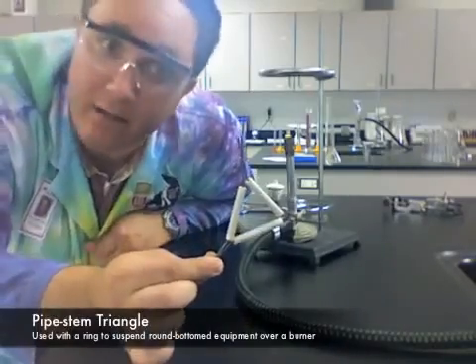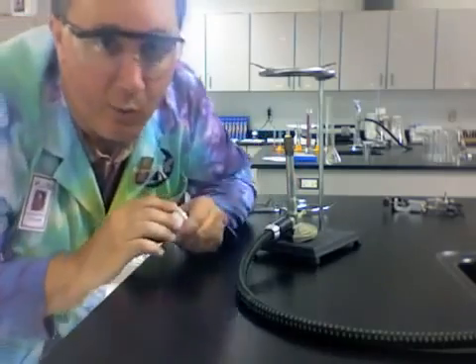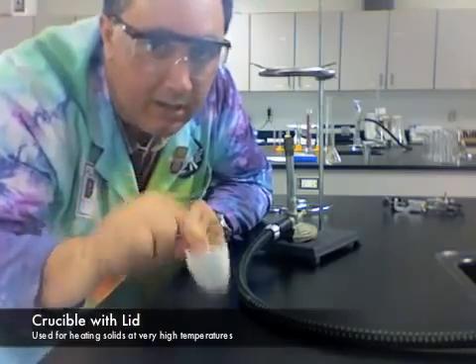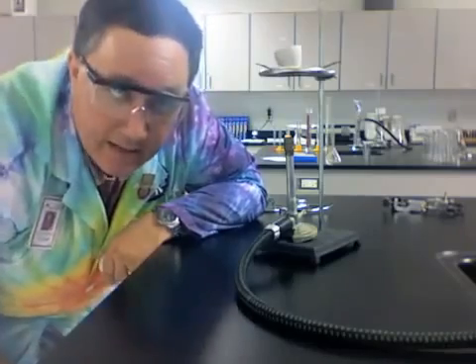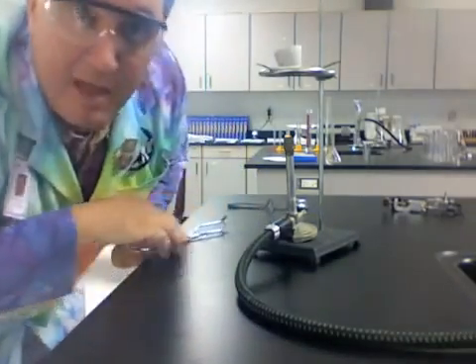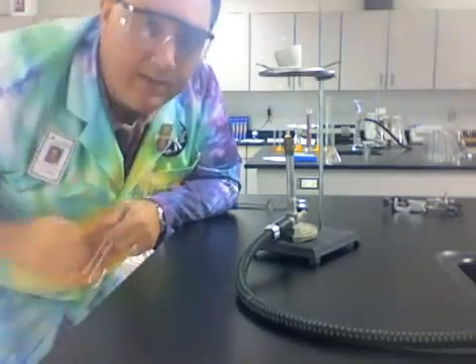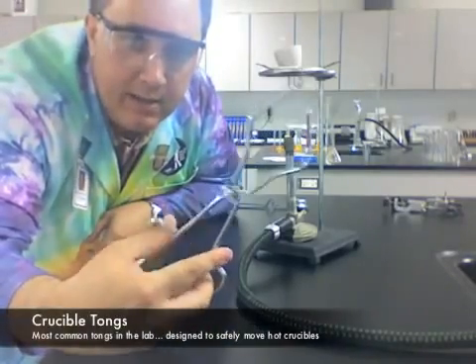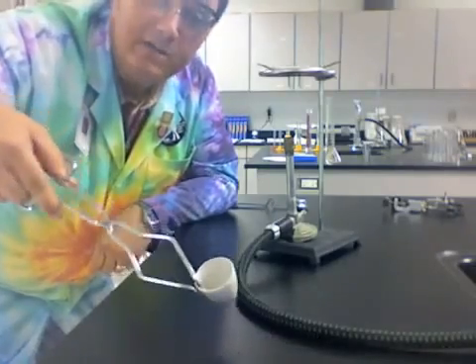Use the pipe stem triangle. We'll put the pipe stem triangle up there, and then we can take something with a rounded bottom, something like a crucible, and it will sit inside the pipe stem triangle just like that. Now, when it's time to get the crucible off of the heat, we can't just reach up there and go, "Ow!" No, we'll use crucible tongs. Crucible tongs, a crucible, and a crucible lid.